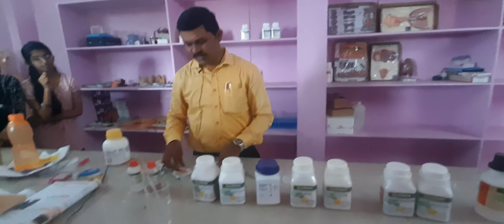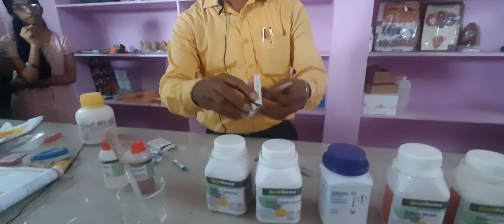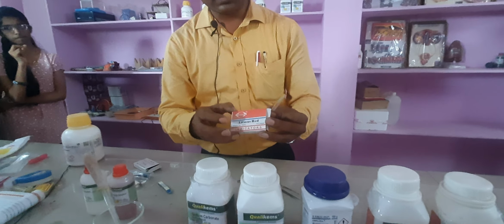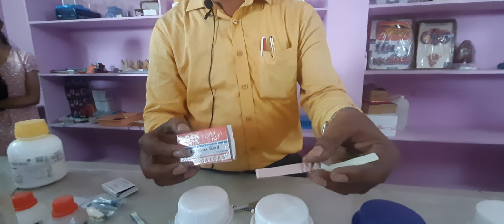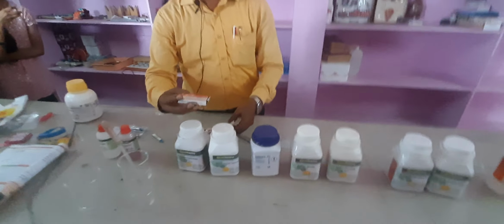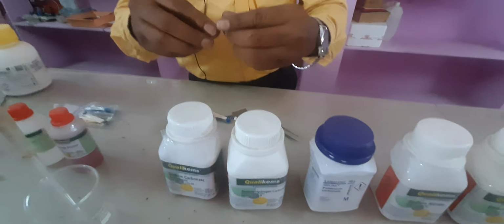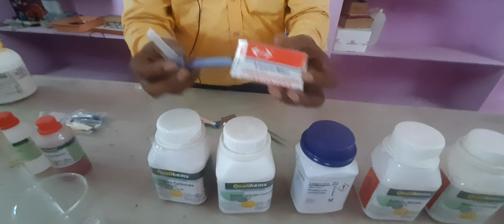Now here are some indicators. An indicator is a substance which is used to know whether a substance is an acid or a base. Red litmus paper is used to find the basic substances. We know this concept very well. This is blue litmus paper, a paper blue in color.